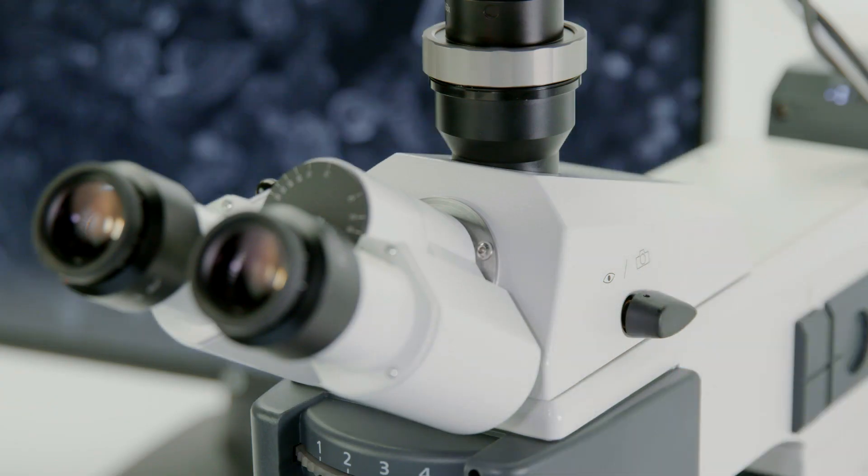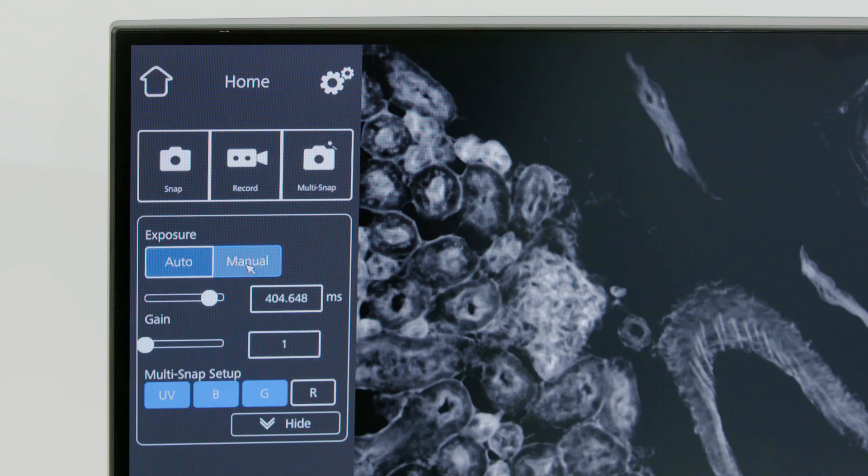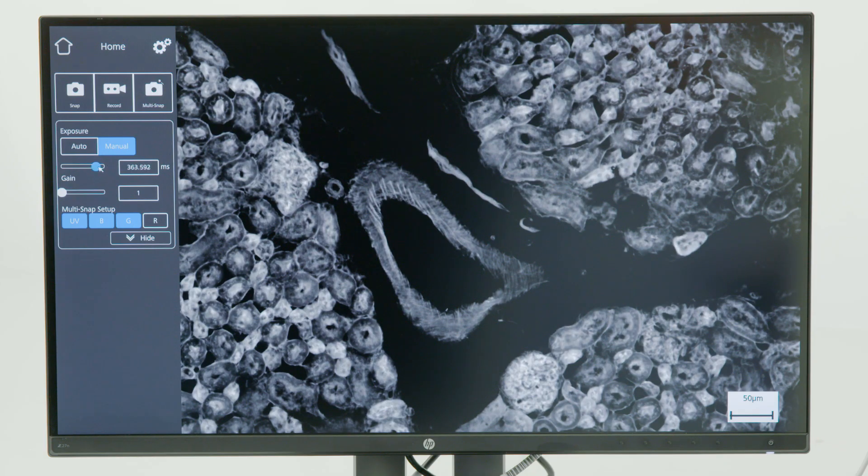Change to monitor view and switch to manual exposure time. Define an appropriate gain and exposure time for the active channel. These camera settings will now also be used for the other channels.